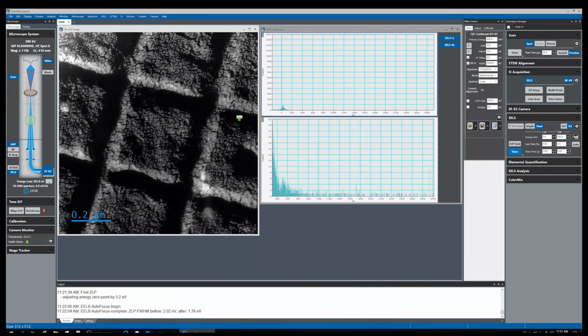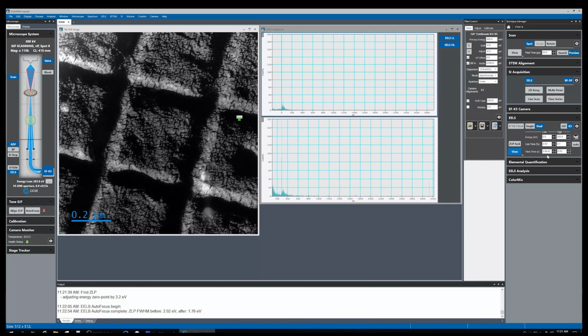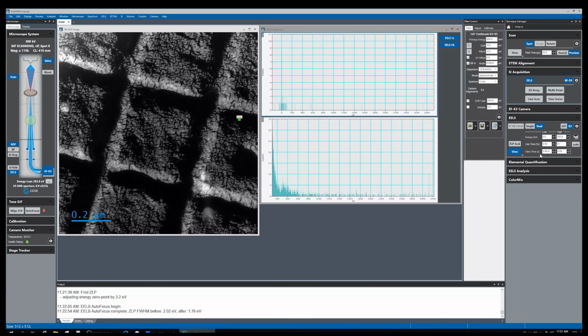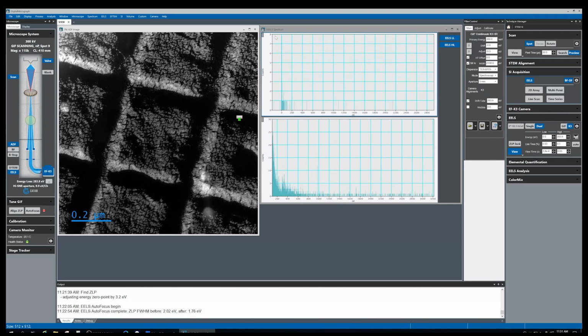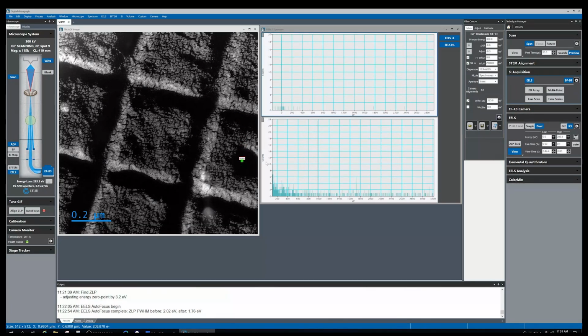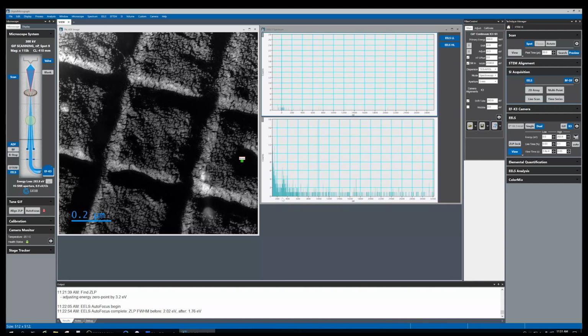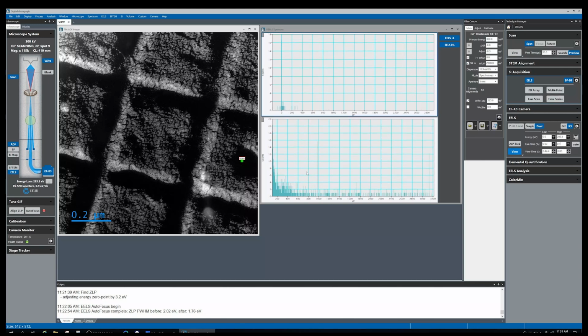And also we can make this exposure time smaller so that our scan becomes quicker. So we're getting about 30-ish counts for the zero loss peak. This is usually enough for this energy calibration.